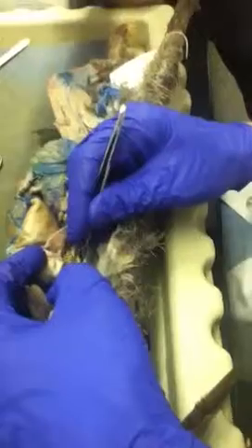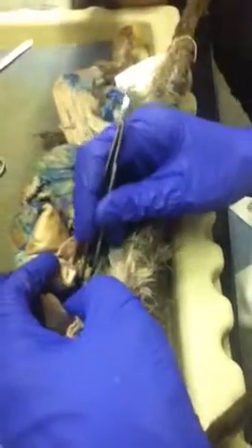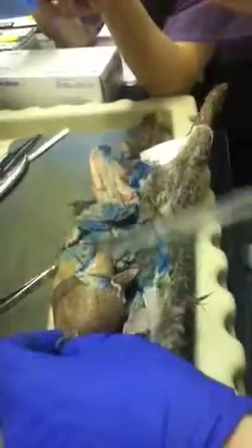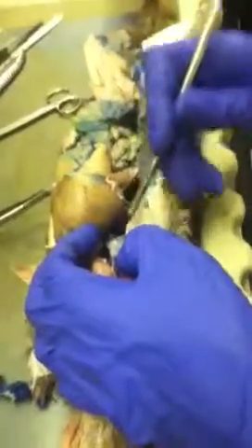And this looks like the hepatic artery coming off the aorta and going to the liver. Hepatic portal is taking the nutrients into the liver. Liver is operating on them, and then it has a very short connection into posterior vena cava. Maybe I can see it if I cut some more through the diaphragm.